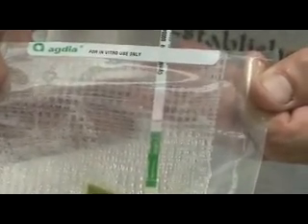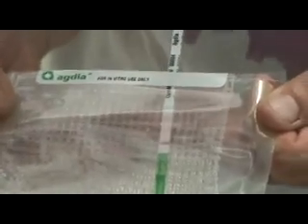It doesn't take very long. You'll start seeing a red effusion work its way up this strip. The first line that you might see would be cymbidium mosaic virus. The second line you might see would be odontoglossum ring spot virus. And then you need to see the top line, which is the control line. You can see the red working its way up now. You see that first line? That means this plant has cymbidium mosaic virus. Looks like we're going to get past the odontoglossum ring spot virus line. And you can see that top line — that's the control line that tells you that you do in fact have a valid test.